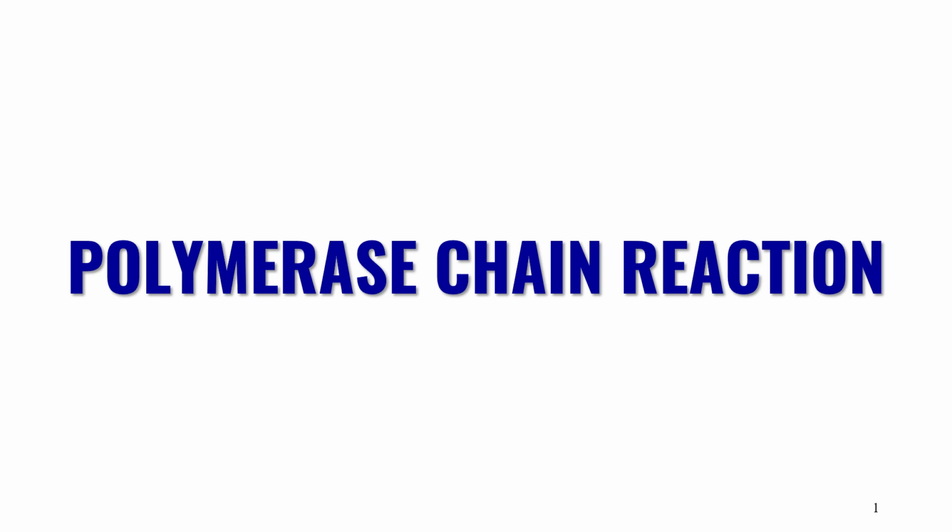Today, I am going to explore the polymerase chain reaction or PCR. This is a powerful recombinant DNA technique which is widely used in both basic research and clinical sciences. In this video, I will walk you through its definition, core principles, methodology, mechanism, applications, and critical limitations. So, be with me and watch till the end.